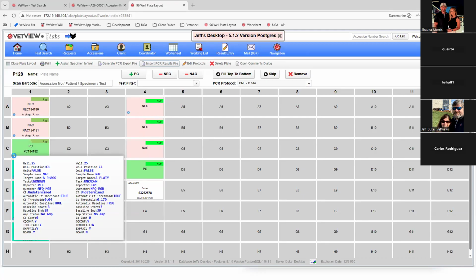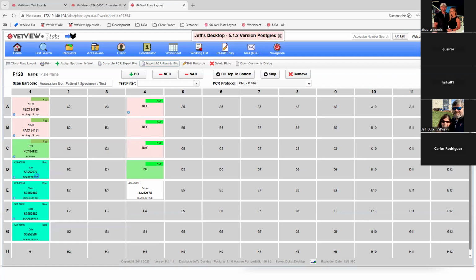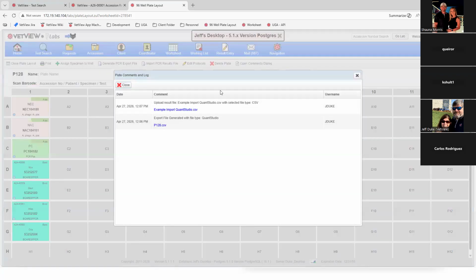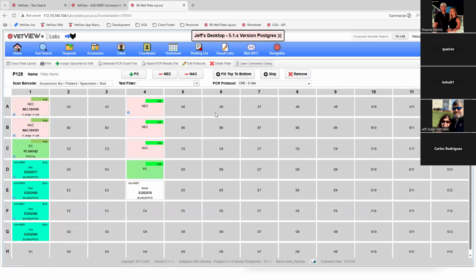And so we've got this, the plate layout and interface there. Again, this is in active development. We're looking at expanding this into some of the other types of plates and technologies, you might say, or types of testing in the future. But this is kind of the starting place here. Again, it does also do controls and record all this. There's a com log that lets you capture the imports and exports there. Again, we're trying to create a paperless environment so that you don't have to track those outside of that view in the system.